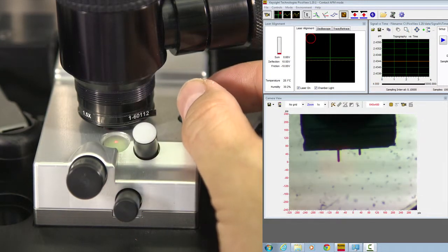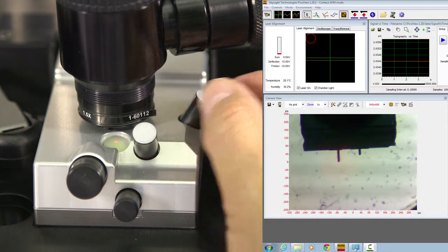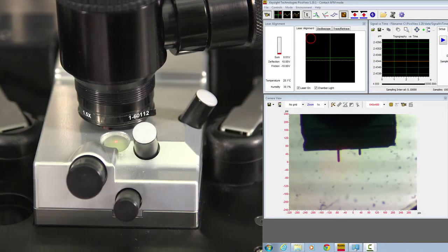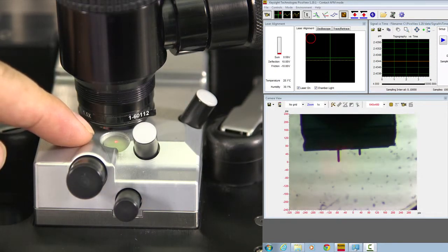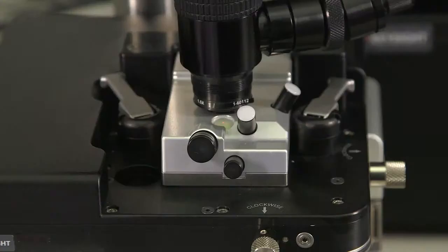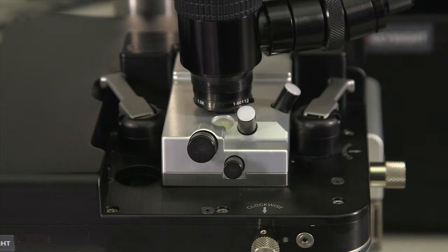Now, when the laser is aligned, from the little window here you can see the reflection spot. We will adjust the detector to capture the laser spot.